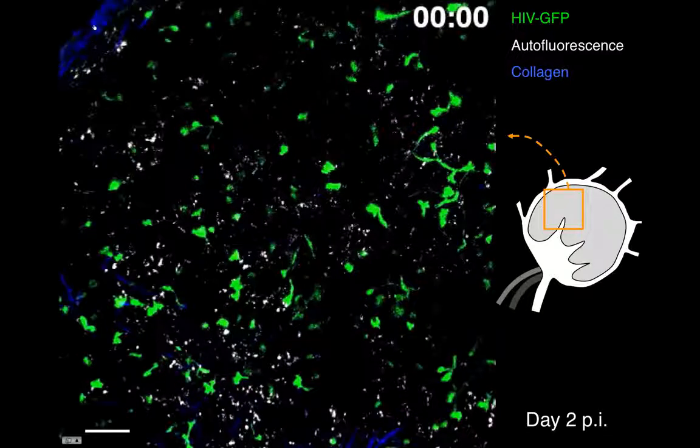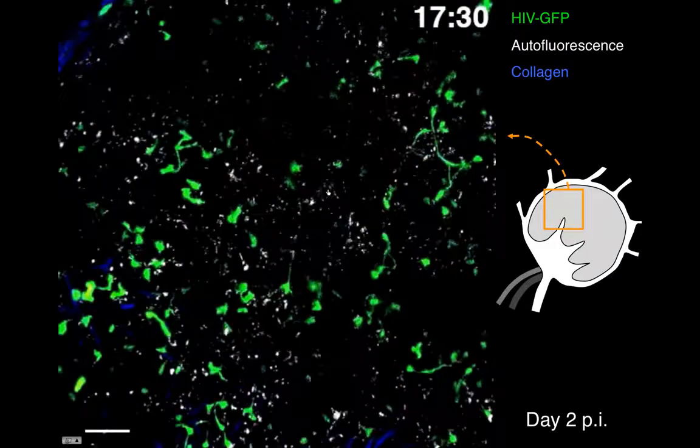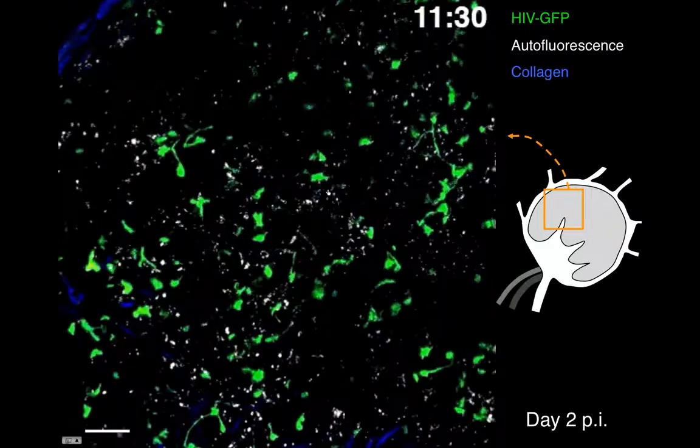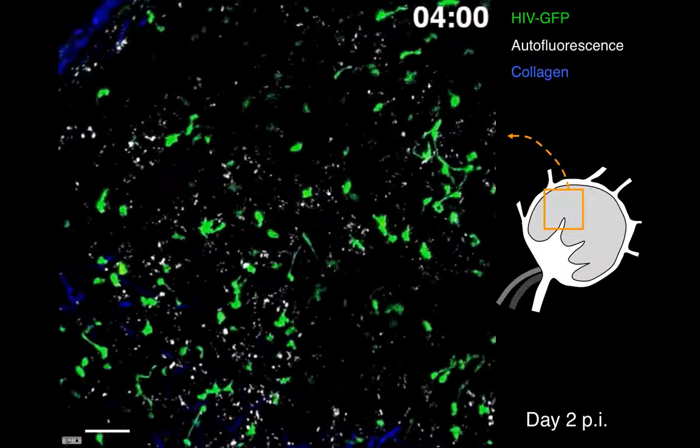And that's probably where the virus also initially enters. You can see that these green fluorescent objects here, which are all T cells, have spread pretty homogeneously within the lymph node cortex, indicating that they have some means of getting around to distributing the lymph node. And when I play the movie, you can see that this is because these cells actually retain their motility. They migrate a little bit more slowly than uninfected T cells, which is something you would notice if you have seen a lot of these types of movies.